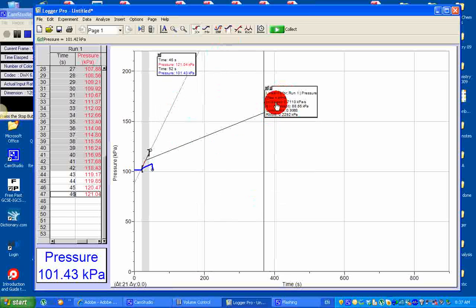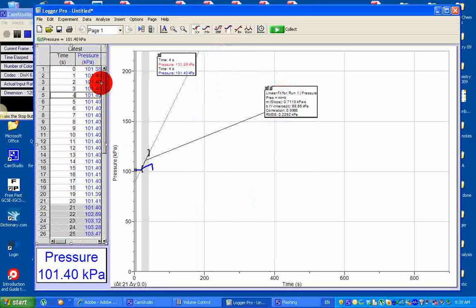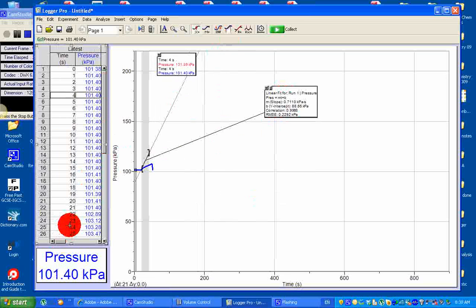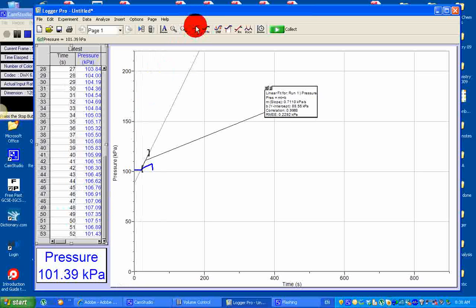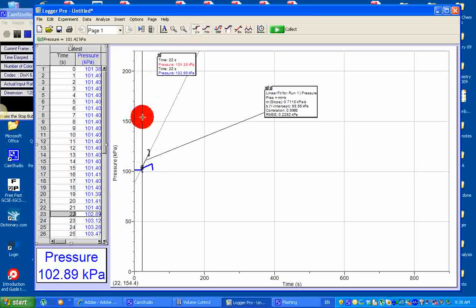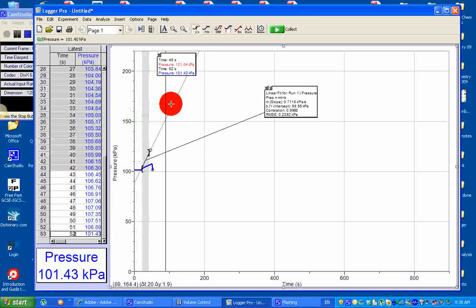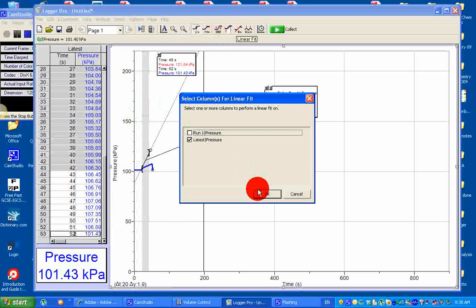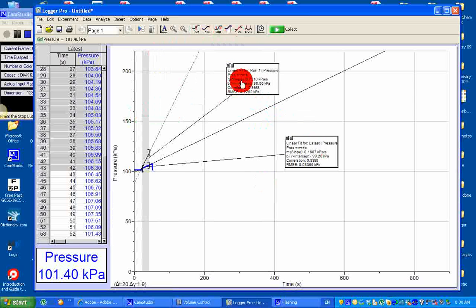Next, the rate of reaction at lower concentration starts at 22 seconds. The reaction starts at 22 seconds. Highlight for the first 20 seconds. Select the latest run, click OK. The slope is 0.7, representing the rate of reaction between hydrochloric acid and magnesium at higher concentration.